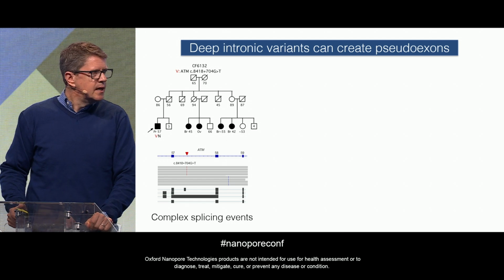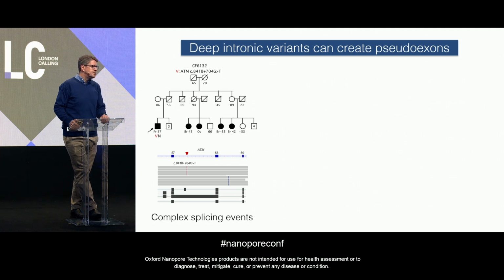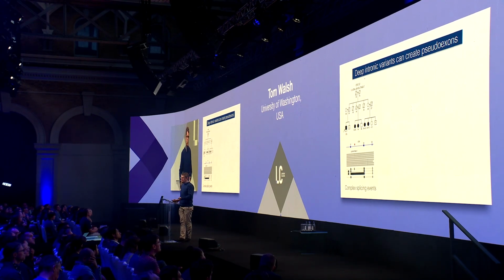And this was actually interesting because it creates three different transcripts. The first line represents the pseudo-exon that was predicted by SpliceAI. But then if you look down to the second cDNA line, you can see there's actually another pseudo-exon in the intron before exon 57, which we didn't anticipate because it's kind of a long way from the normal splicing machinery. And then the third transcript that we saw is that pseudo-exon from intron 56, followed by a complete intron inclusion event. So the full intron from exon 57 to 58, which is about 3 kb, is incorporated in that message.